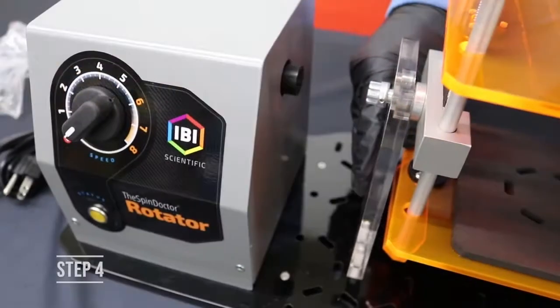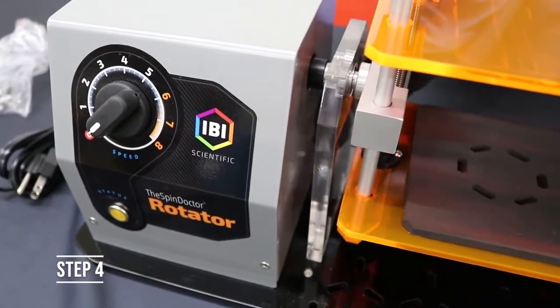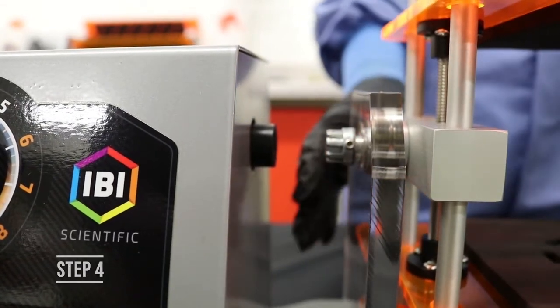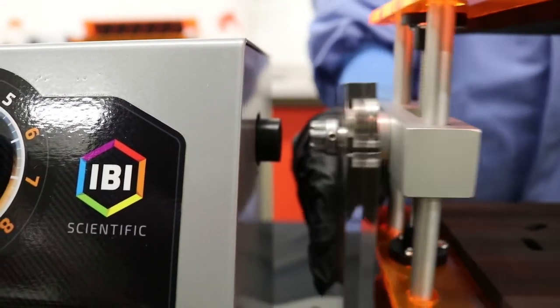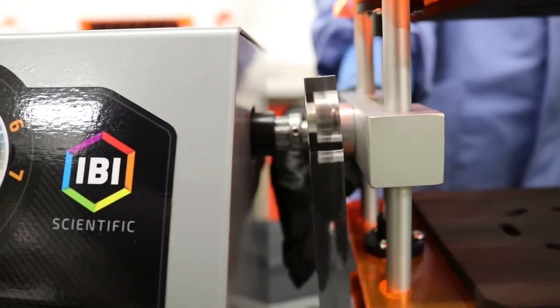Step 4. Carefully slide the platform assembly over towards the control box, aligning the rubber motor coupling and the platform assembly output shaft. Slide the platform assembly into the rubber coupling so both parts are fully mated.